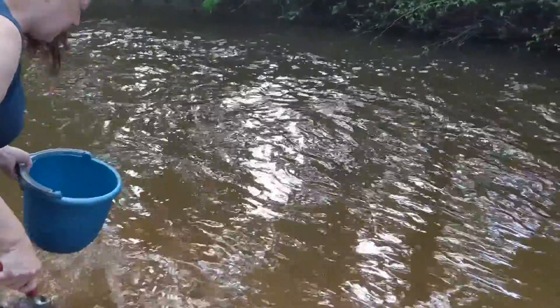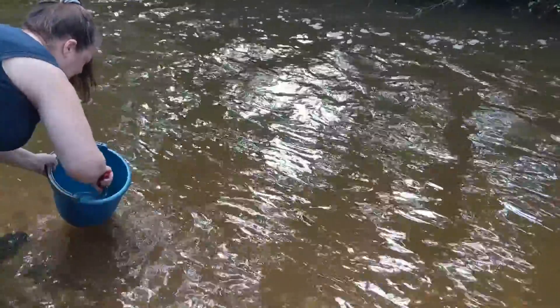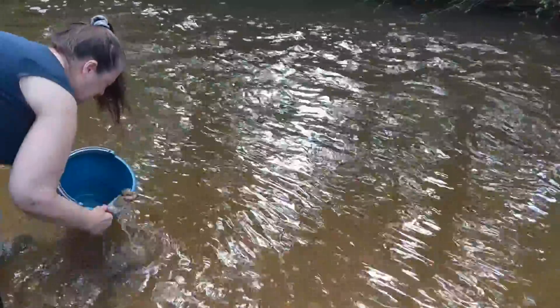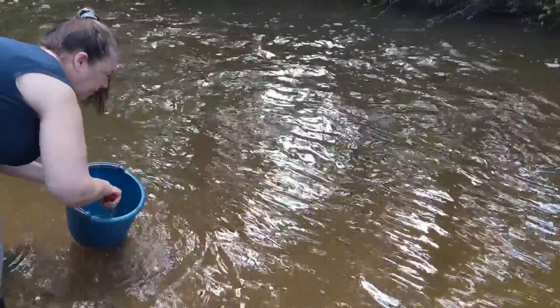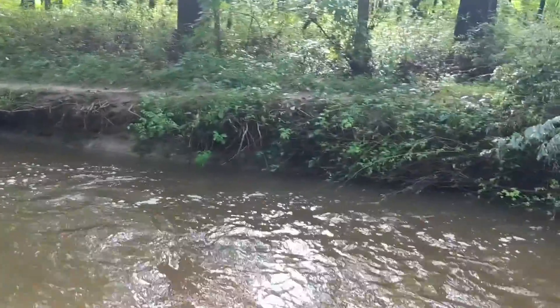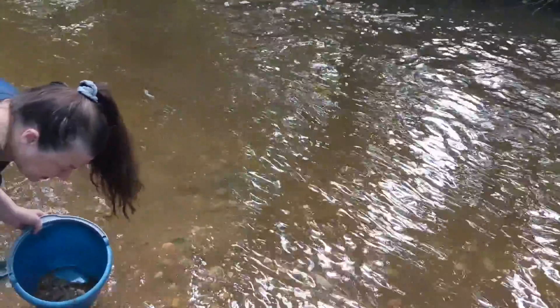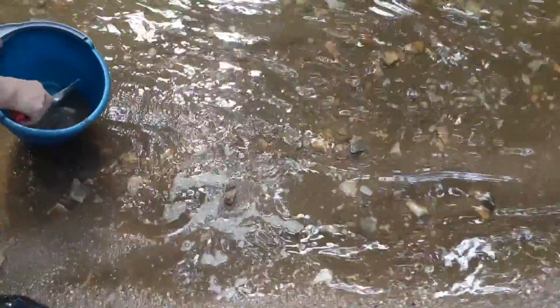We can just go into wherever we can get some good sand and silt. A little less rocky here — this might be a good spot.